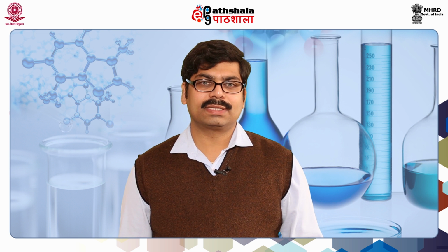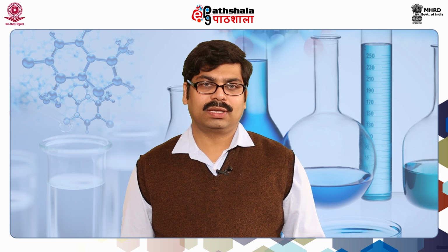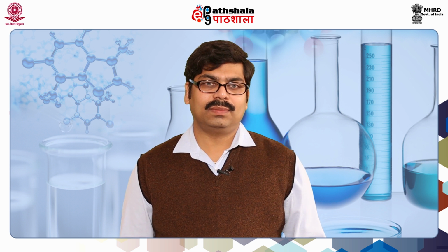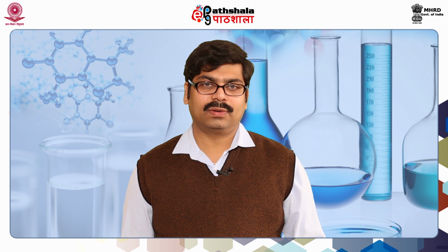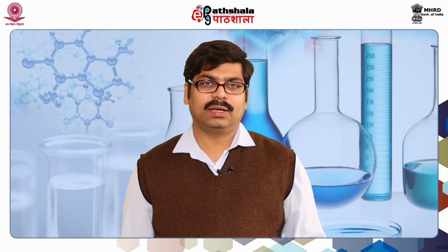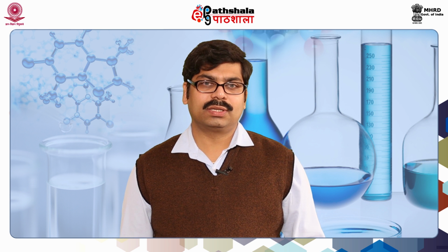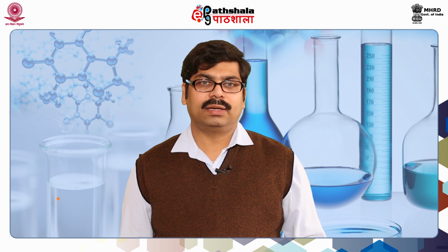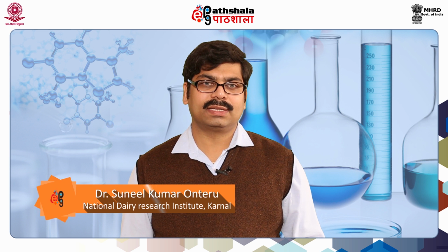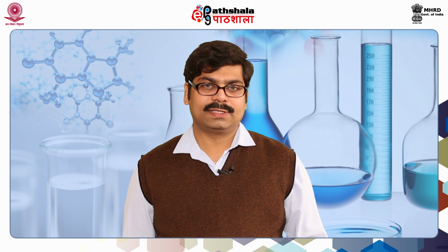Today we are going to discuss another lecture on HPLC in the paper Biochemistry. HPLC means high performance liquid chromatography. In this lecture, we are going to study the principle of HPLC, the instrumentation of HPLC and the limitations of HPLC, and finally we are going to discuss the supplements to the HPLC.